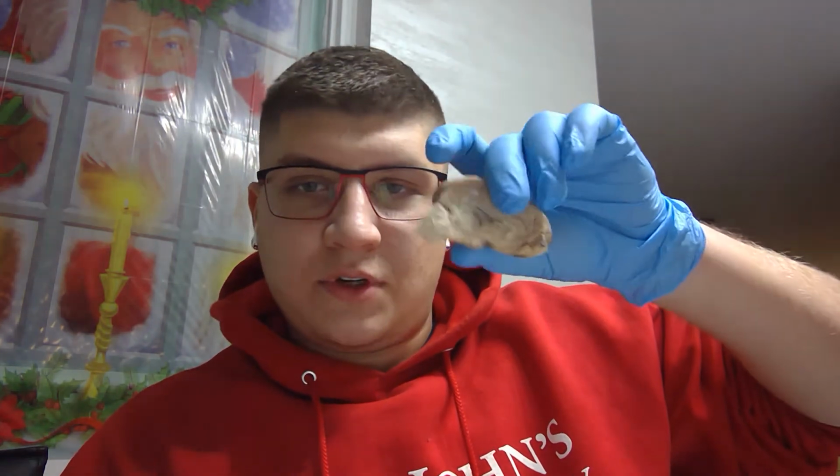Today is November 30th, 2021, and today we're going to be doing the sheep brain dissection. The dissection was already performed, and we're just going to be going over the anatomical landmarks of the sheep brain. Just to show you, this is the left side of the sheep brain.